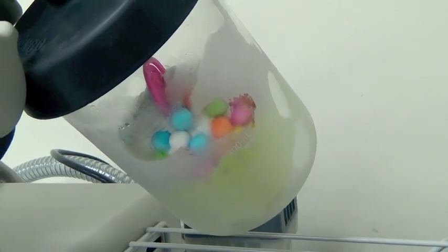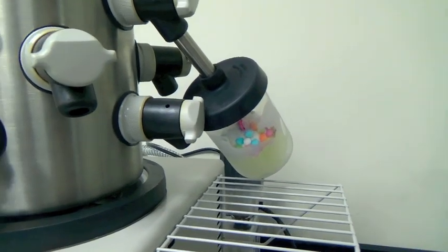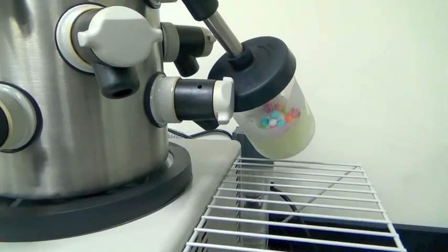Do you suppose that the Freezone is enjoying its cupcake? I think it is — it's the most candy that's ever been on that machine for sure. Kelly has freeze-dried our cupcake for us, and the Freezone seems to be happier than ever before.